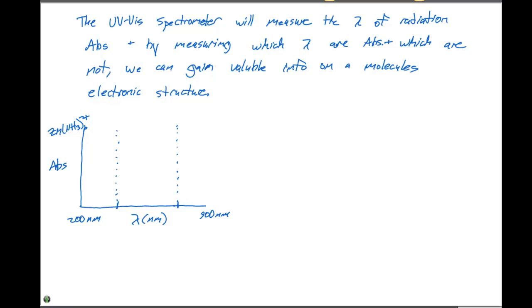If we have a solution that is clear or colorless, are we going to see an absorption in the visible spectrum? Now, you guys are shaking your head no. That's good, right? We are going to see pretty much zero absorbance throughout the visible spectrum. So if we look at this pattern right here, which I'm going to draw up on the board, at very low energy, the zinc has an absorption which is pretty much zero. Then as we go to higher energy levels, you see this big bump right here.